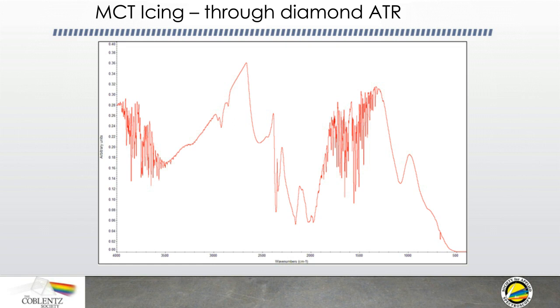I'm showing my age, but I actually sat on the committee when that was put together. And the level one test, I would not recommend trying to reproduce at all, because there was a lot of discussion, and basically it goes into much more detail than you need for an instrument that is performing in a typical analytical lab.